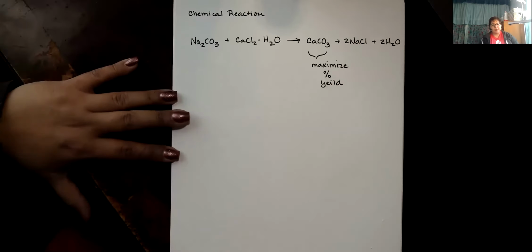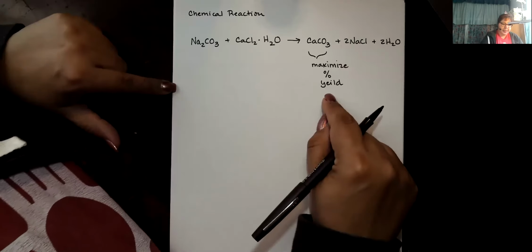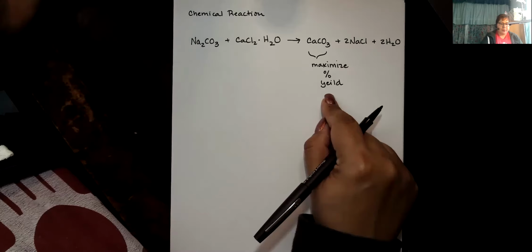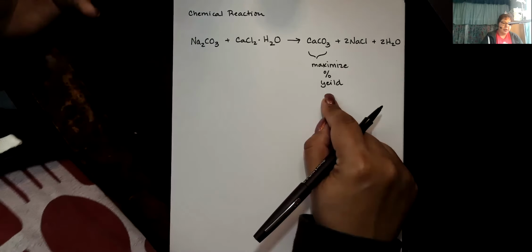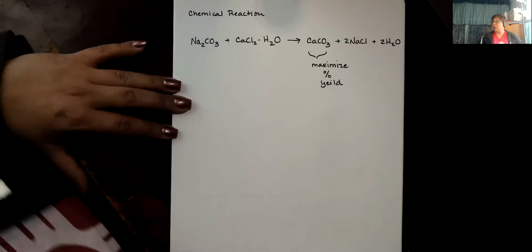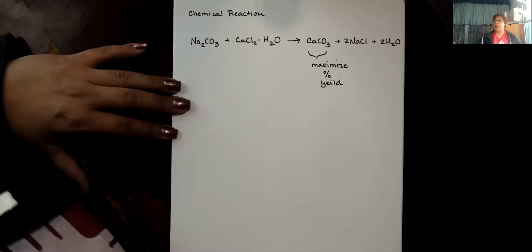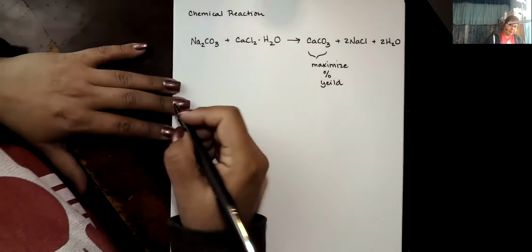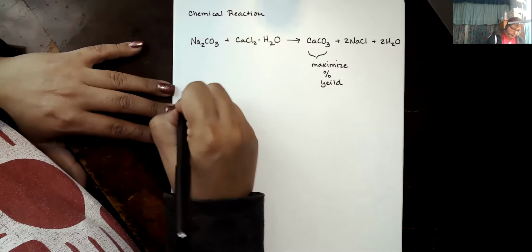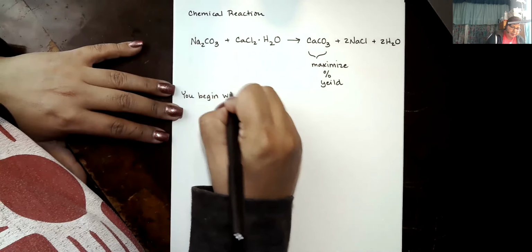of this compound. Now, we did not get to percent yield exactly in lecture, so that's kind of why I wanted to go over a sample calculation of how you would calculate percent yield. So that's what I want to do with you right now, is to do a sample calculation. So let's say, for example, you begin today's activity with these amounts.